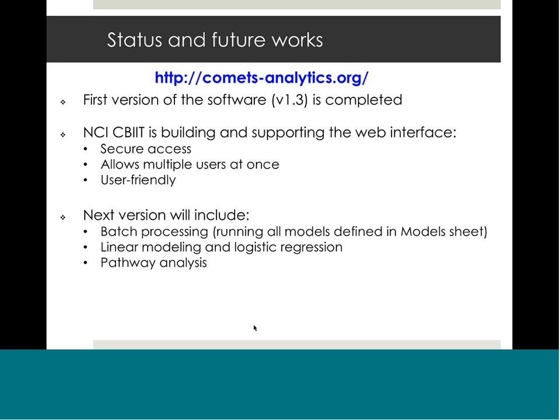Second, we are working toward incorporating linear modeling and logistic regression in addition to correlation analyses. And then third, we will be incorporating pathway analysis. So this becomes important as we're trying to interpret the metabolites that are significantly associated with the outcomes of interest.